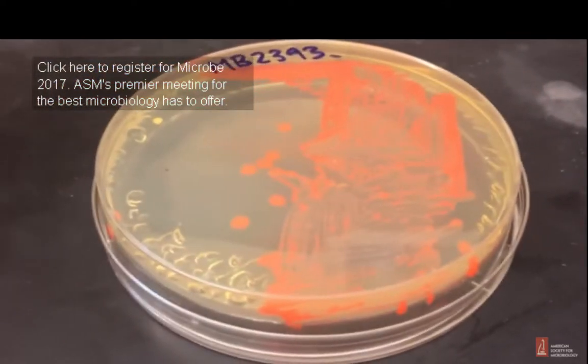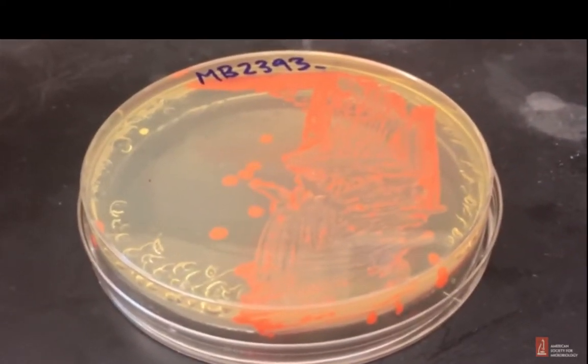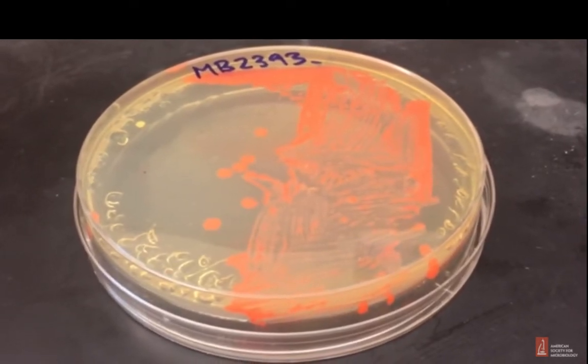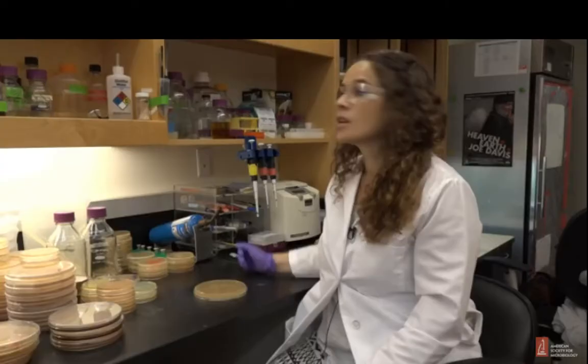We also use environmental isolates, but that is not recommended unless you can be absolutely sure of what you are working with. For example, we sequence our isolates to find out what they are and make sure they're safe to work with. Remember, of the 30 million bacteria that are out there, we only know of 70 species that are pathogenic to humans, but you don't want to accidentally grow something that can make you sick.